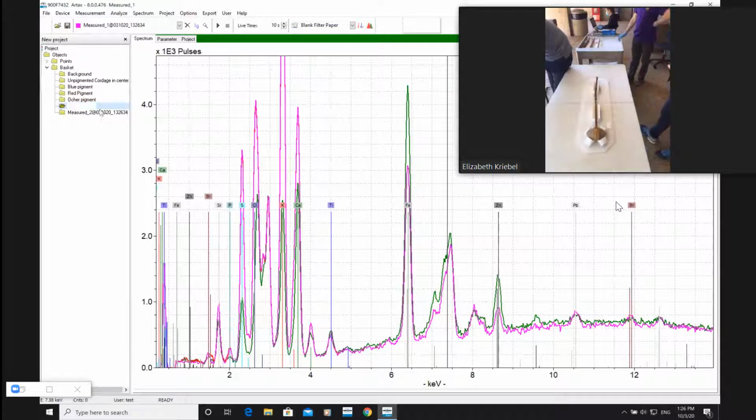The other shaft. There's a question. Yeah, one minute. What's up? From Anonymous: methyl bromide pesticides, some that contain chlorine, have been used in the past to treat organic objects in museum collections. Some people have reported residues from that treatment that can be detected via PXRF. How can we tell the difference between salt-washed leather and whether the Cl and Br are residues from pesticide treatment? So it's going to be quantity, right?